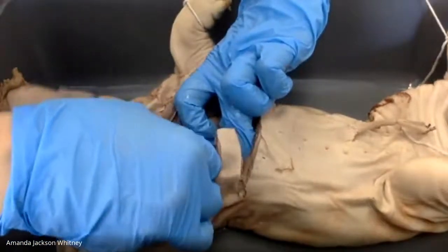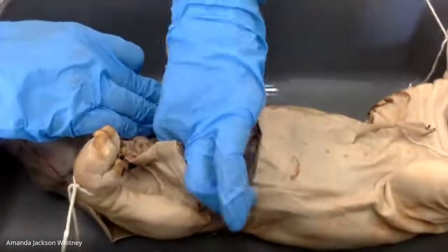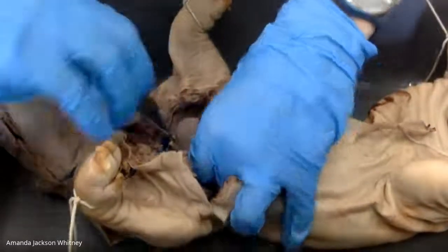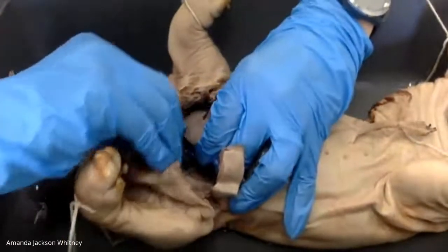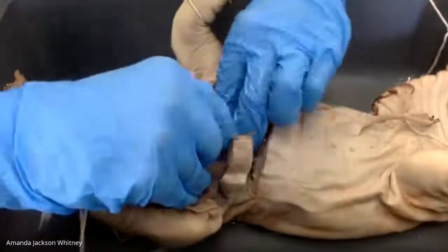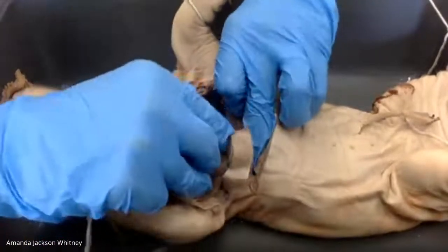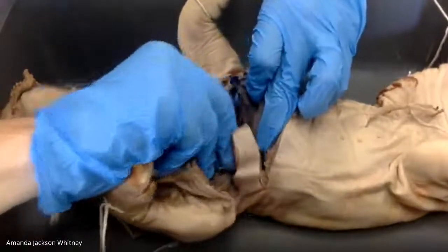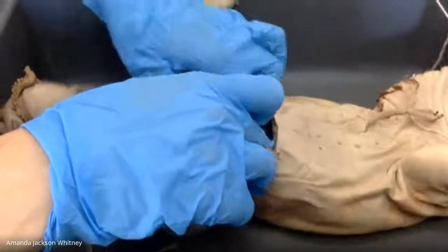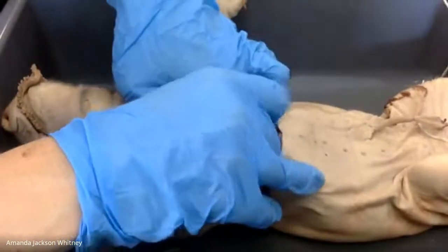That tissue, like we were talking about, has that water layer in between, the outermost layer of the lungs, and then that surrounding layer that's connected to the rib cage. And when the muscles contract to change the size of the thoracic cavity, the lungs just go along with it because of that water layer in between those two membranes, which all sticks together because of hydrogen bonding, for any of my chemistry fans out there. Hydrogen bonding.